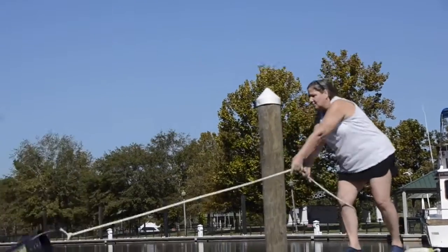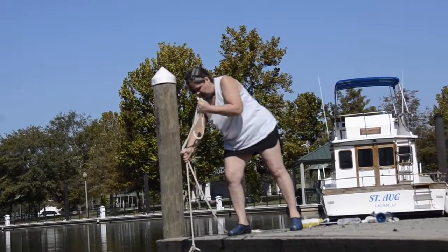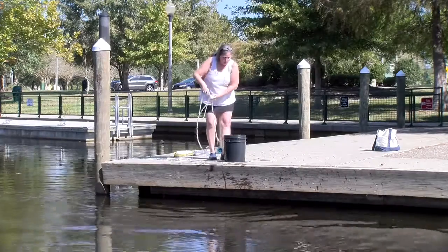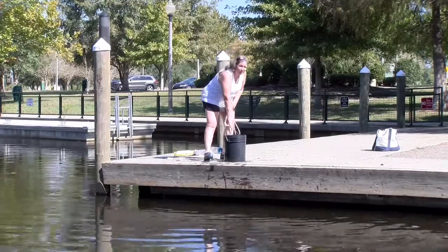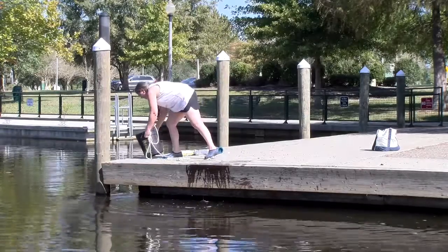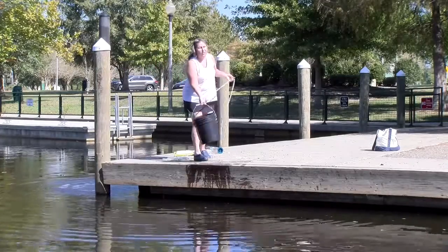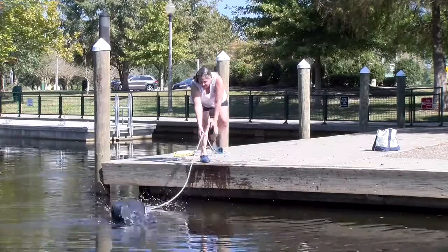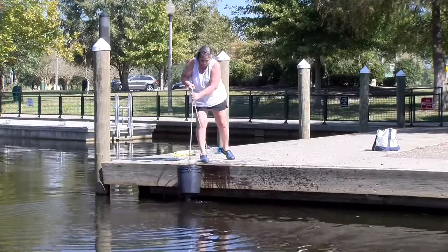You throw the bucket out away from the shoreline and you pull the surface water, and the water that you have is what you'll use for your testing. Let me show you one more time how to take the water sample. You're going to throw it away from you, out into the water, and catch the surface water and pull the bucket towards you.